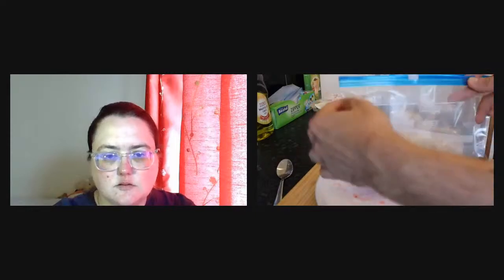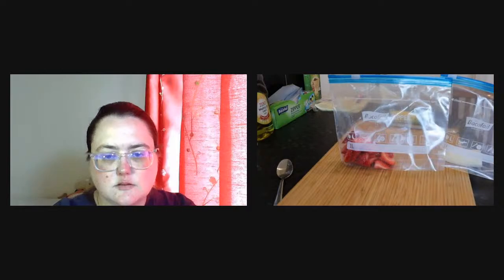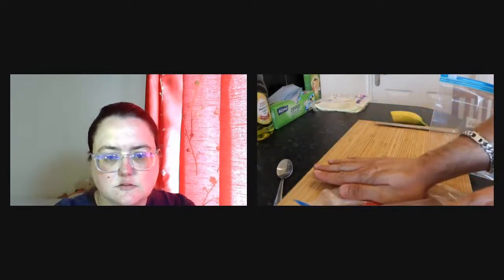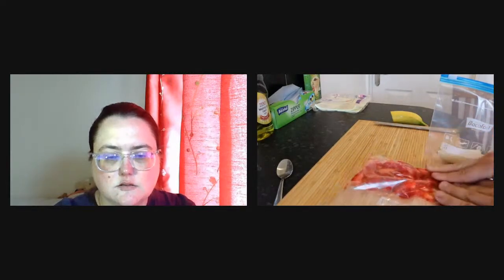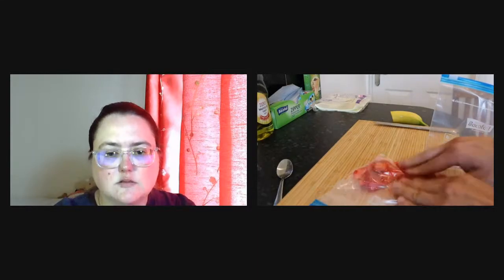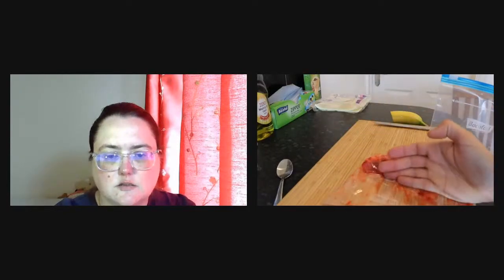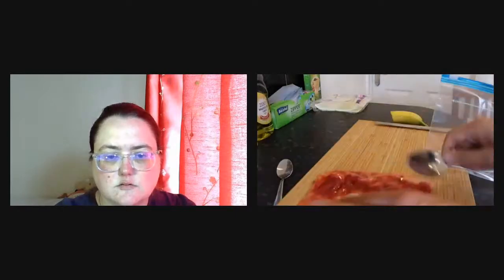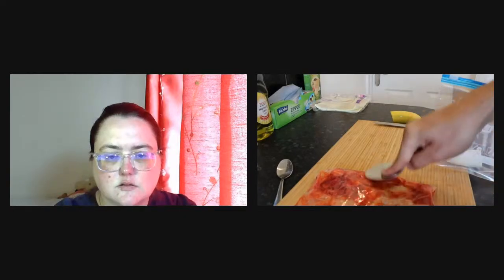Okay, so you can see here I have my fruits, here and here. I'm going to remove the plate. I don't need it anymore. What I'm going to do is mash the fruits into a sort of puree. I really want to break all those fruits to have as many cells available as possible for the next steps. So I just mash them. You can use a spoon, going around to push them, to break them down very easily.